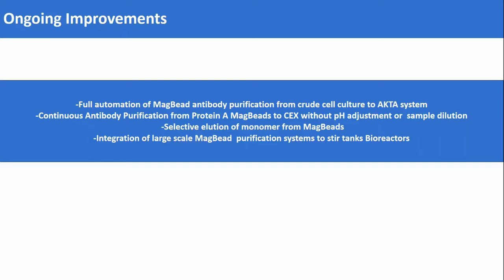into the processing vessels. There is also a possibility of processing the beads within these bioreactors. So the bioreactor will not only grow cells, but it will be able to do the purification. So you reduce cost and cycle time of transfer of the beads into another vessel.